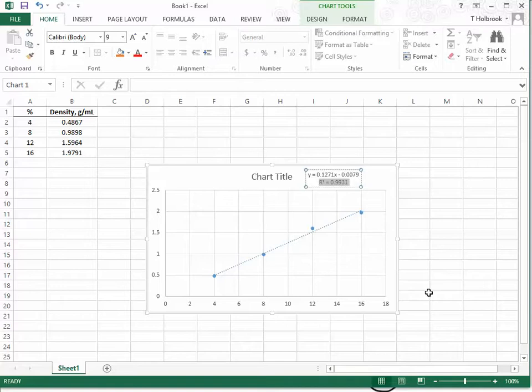And in the beginning for what we're doing, and because many of you have never been in a lab before, 2 nines are good. 0.98 would be good. That's really what we're after. So what we want to see is a really close number to 1. 0.98, 0.99, all of those are acceptable for now. We will get more stringent later on, but for now, this is completely acceptable.